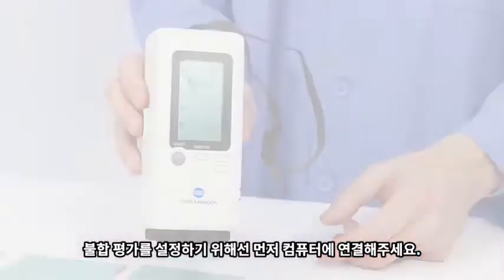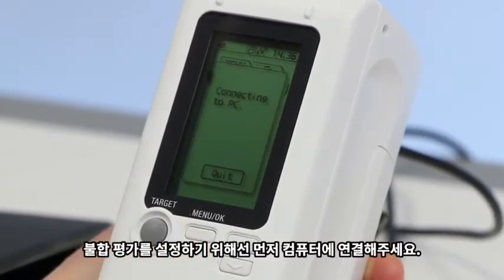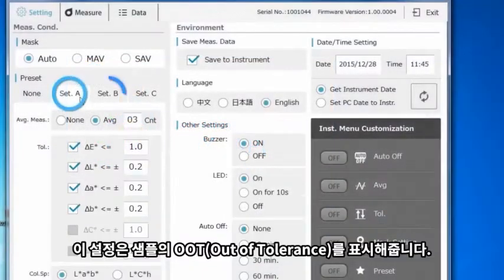To set up custom pass and fail judgments, first connect the instrument to a PC. Then enter three separate tolerance settings in the included utility software. These settings will highlight your out-of-tolerance sample readings.